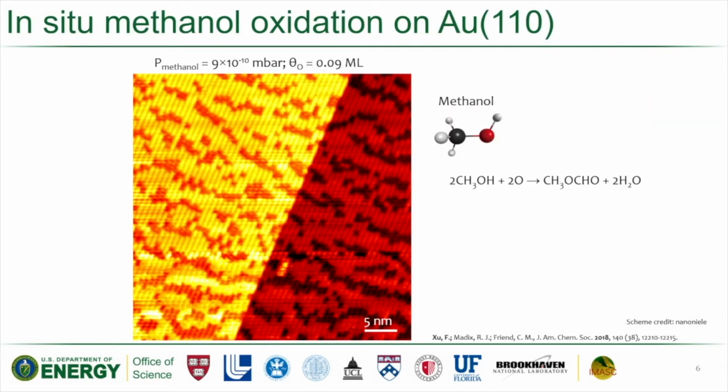Okay, with this surface, I'm going to expose methanol at room temperature. A very low amount of methanol, though, around 9 times 10 to the minus 10 millibar. That's already after background subtraction.